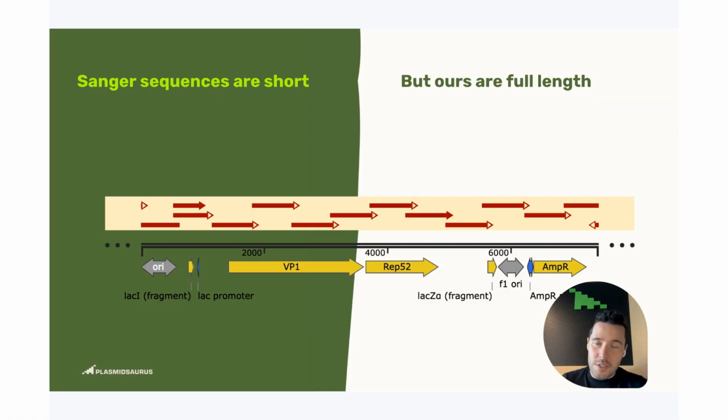And it's possible to do, as this image shows. This is, again, real data. But it's very annoying because you have to design primers that ever so slightly overlap. And you still have to make sure of all the normal primer things. You have to think about melting temperatures, primer dimers, primer hairpins, GC content of the primers, which obviously just takes a lot of time. So it's possible, but laborious. And not to mention that doing multiple Sanger runs actually becomes quite expensive. So if you were to do it this way, it would cost significantly more than doing it with us.